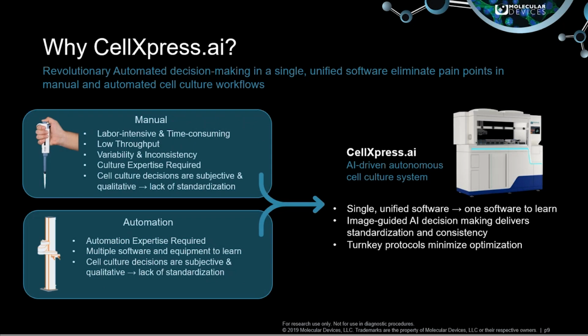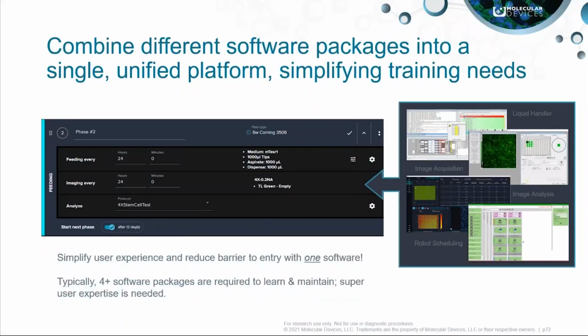Most interestingly, it has software which enables you to combine these different tasks and different parts of the device. It controls liquid handling, imaging, the incubator, and moving plates from, let's say, the incubator to the imager or from the incubator to the liquid handler, and so enables you to design and execute multiple experiments and multiple steps of an experiment.